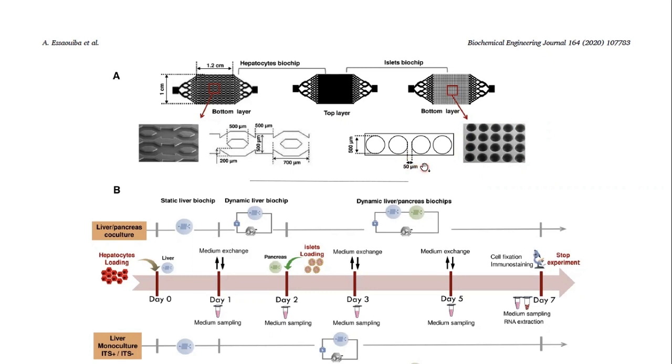It has a second PDMS layer, the top layer, with a reservoir, and this here is the top layer. It has a depth of 100 micrometers.